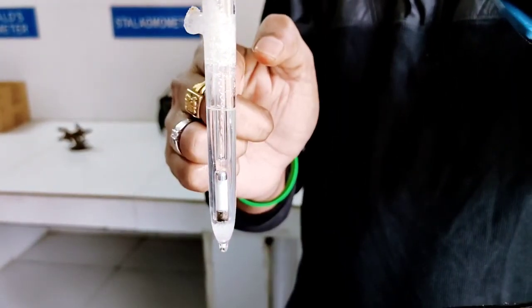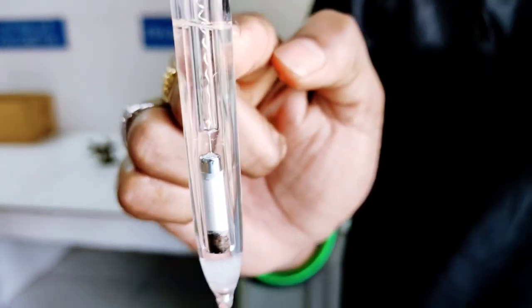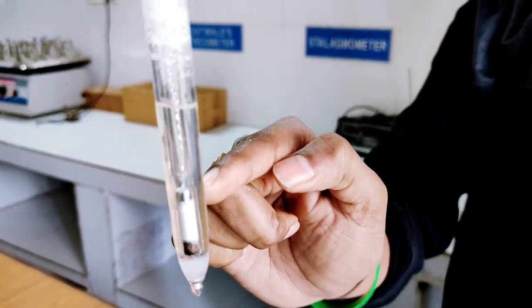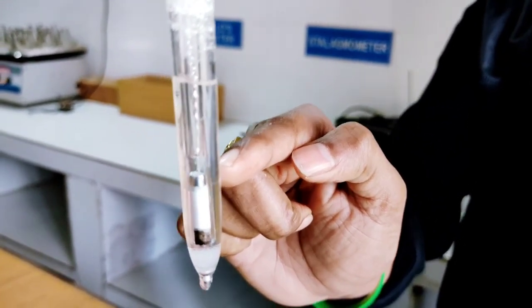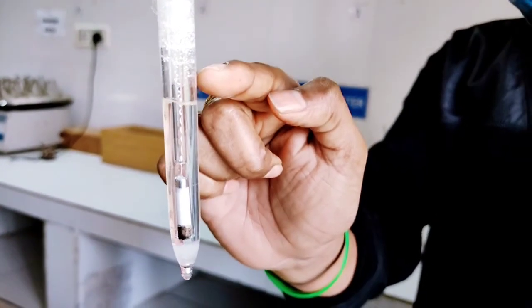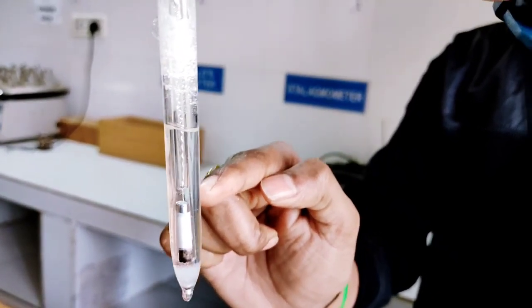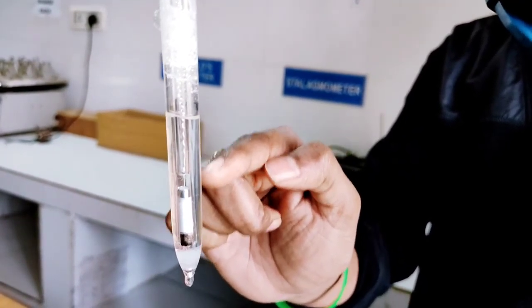Now in the internal glass tube, you can see the platinum wire here. The platinum wire is resting on the mercury, on which mercurous chloride is present. In the internal glass tube, the platinum wire is resting on the mercury on which the mercurous chloride is present. What is the mercurous chloride? Mercurous chloride is calomel. The trade name of mercurous chloride is calomel.